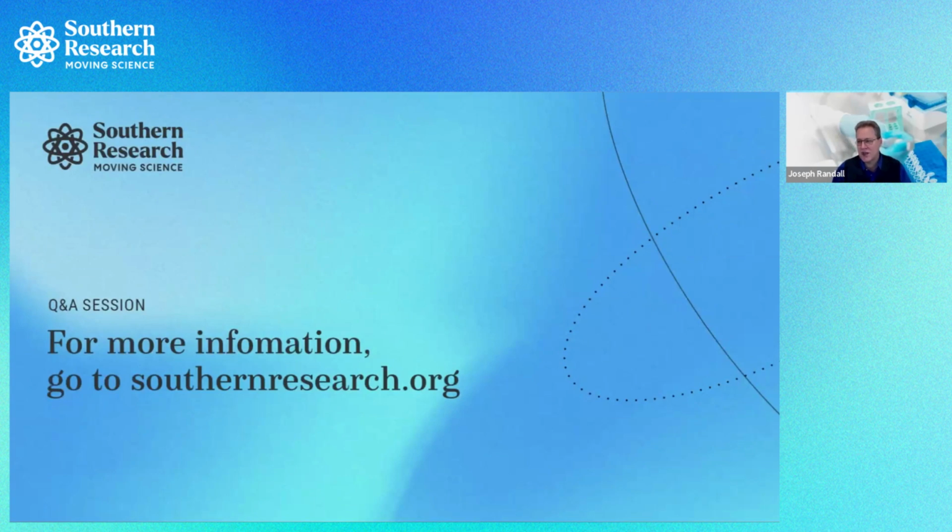So I did want to answer this one. Is your brain sectioning SOP available for other researchers? The answer to that question is no, but I do recommend that all of this information, in terms of which parts of the brain, the sectioning and the scoring methods, are all available in the WHO Technical Report Series 978, Annex 2 and Annex 5. I think it's Annex 5 where it lists the different regions of the brain that have to be sectioned, how they're scored, and how you get a composite score, at least for evaluation of neurovirulence of yellow fever vaccines. So I encourage you to look at that WHO reference guidance.